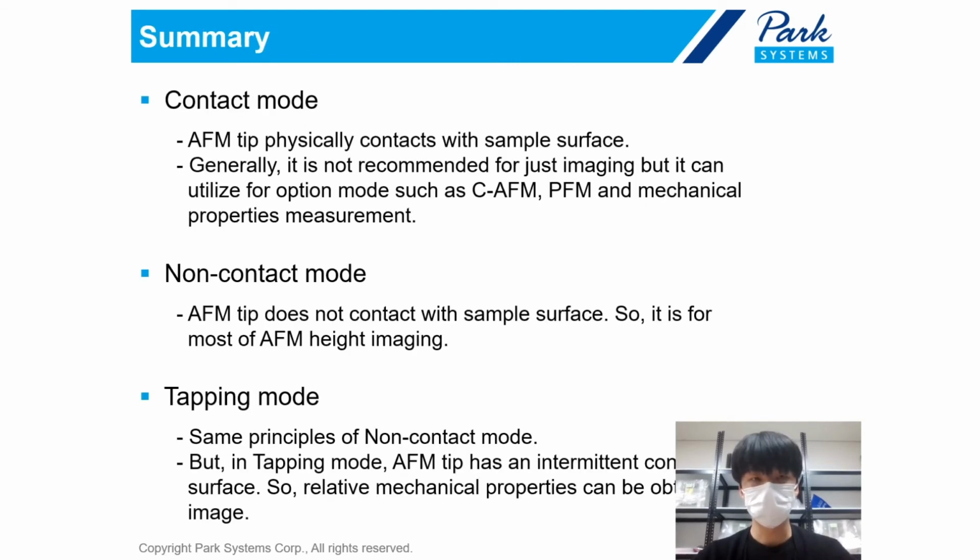So, to sum up the three different basic AFM modes. In contact mode, the AFM tip physically contacts the sample surface, and generally it is not recommended for just imaging, but it can be utilized for optional modes, such as conductive atomic force microscopy and piezo force microscopy and some mechanical properties measurement.